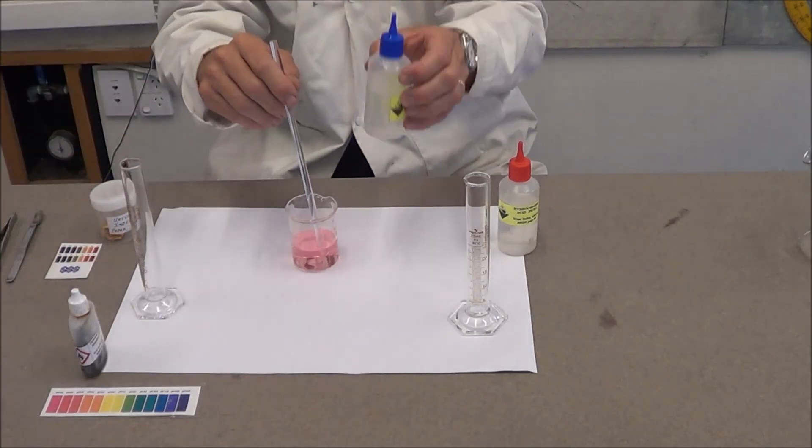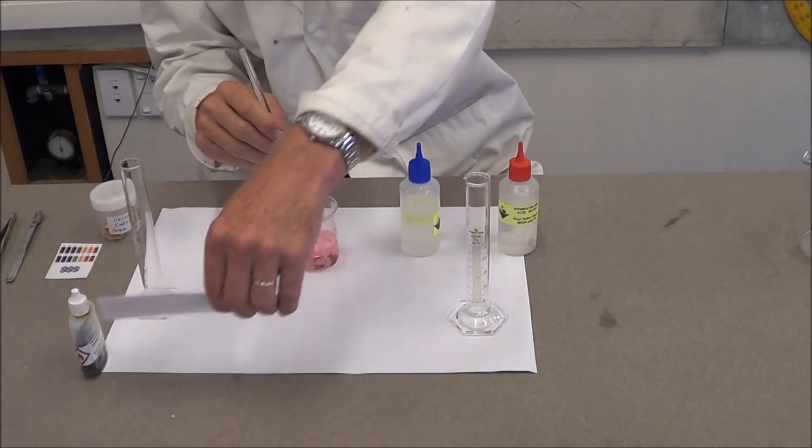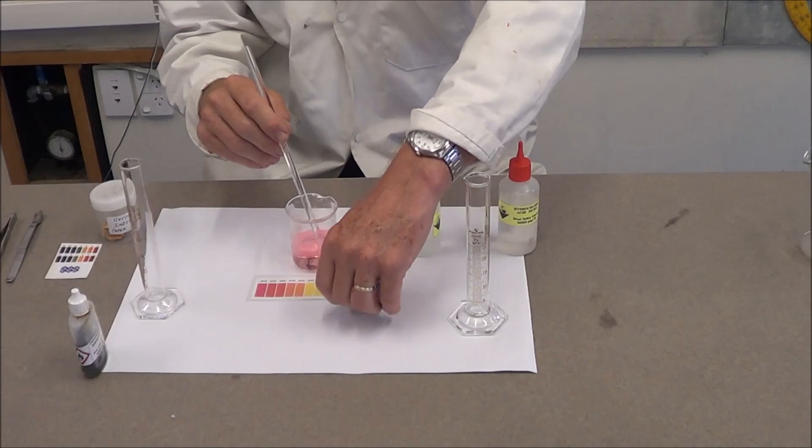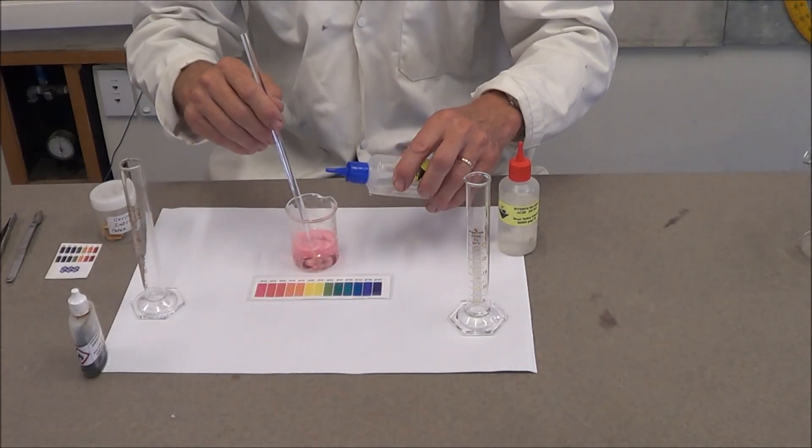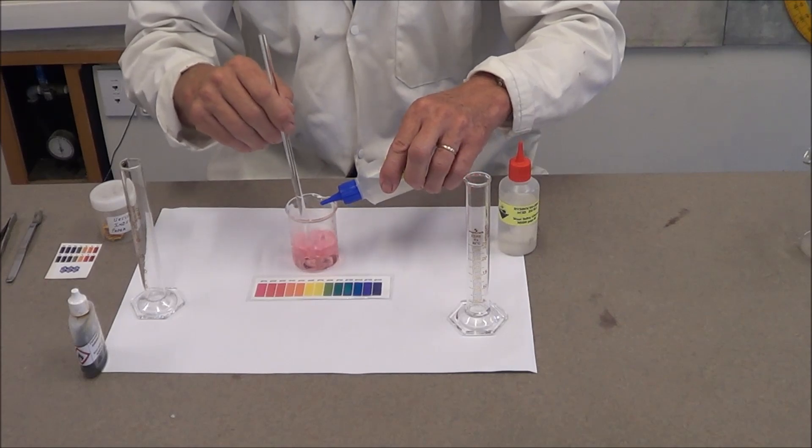We then add sodium hydroxide gradually, a drop at a time, until we reach the pH of 7, in which case all the acid will be neutralized and hopefully there will be no extra sodium hydroxide added.